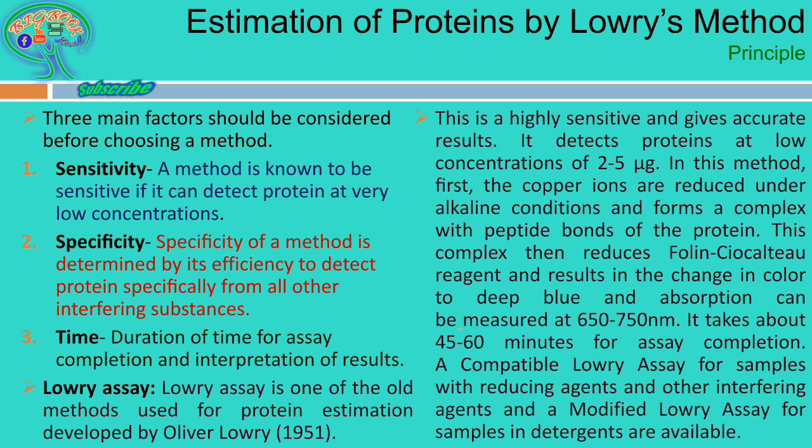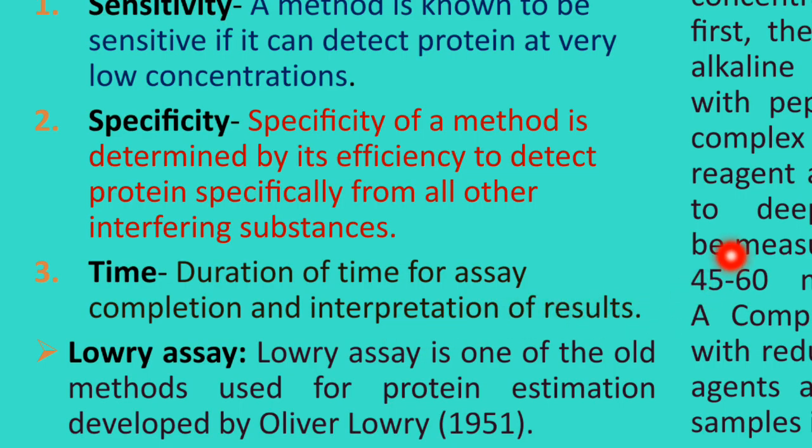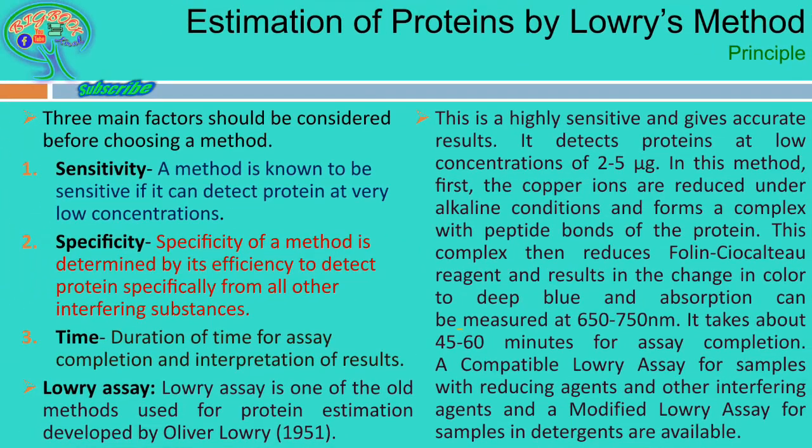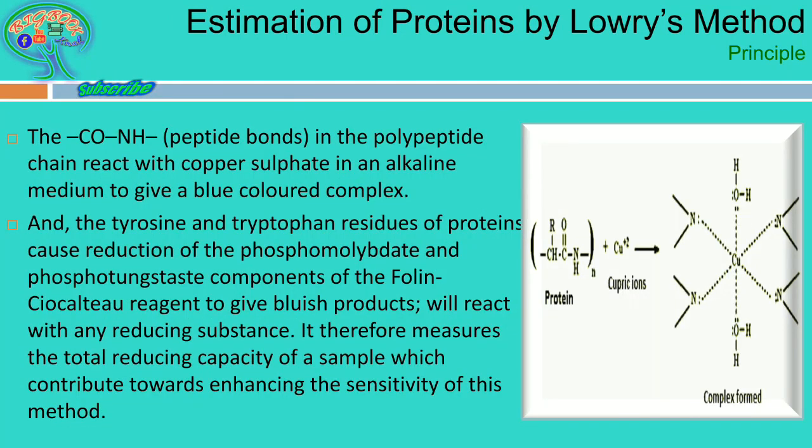Compatibility of the Lowry assay for samples with reducing agents and other interfering agents, and a modified Lowry assay for samples in detergents, are available. This last point on the Lowry assay is a little bit of technique and history which we have spoken about in short form. In the next slide we will discuss the actual principle.